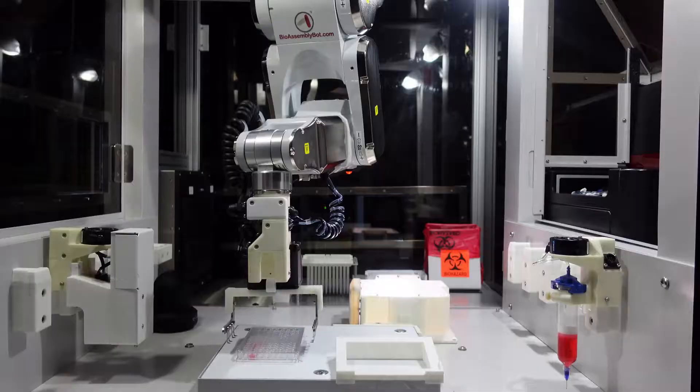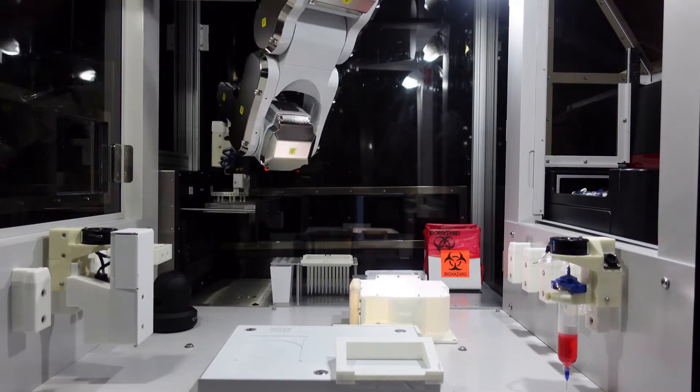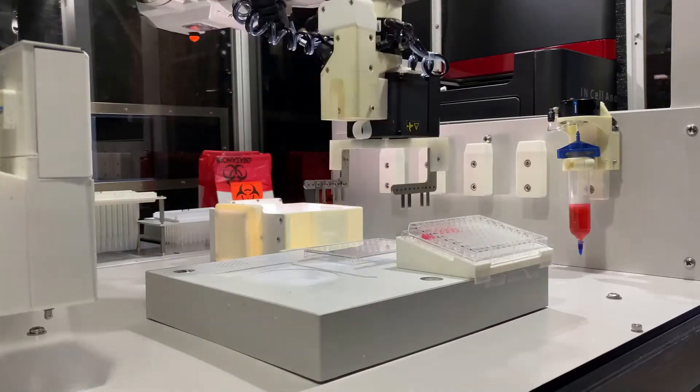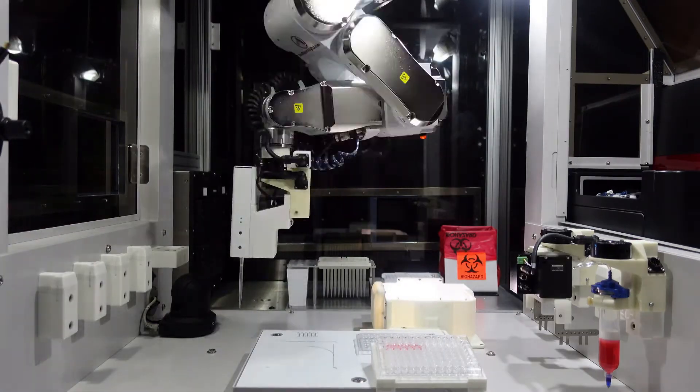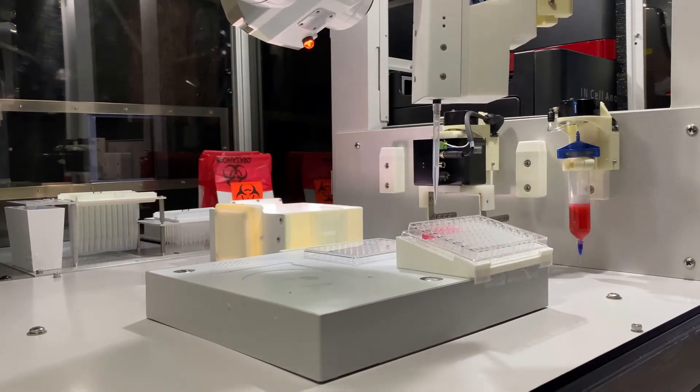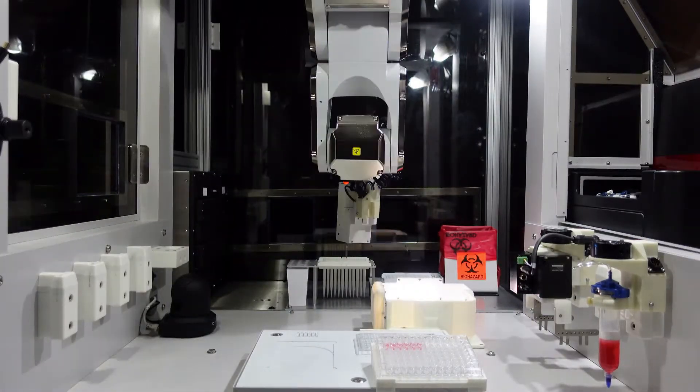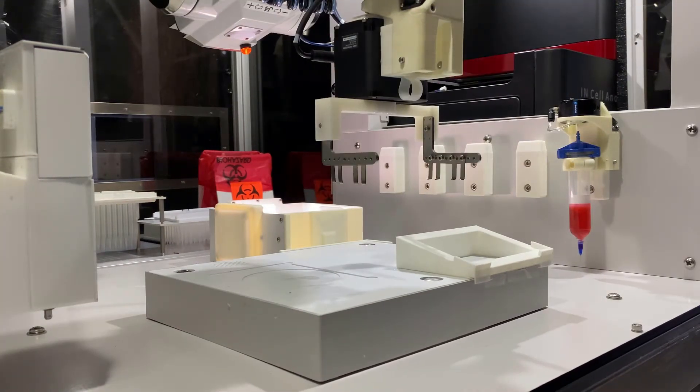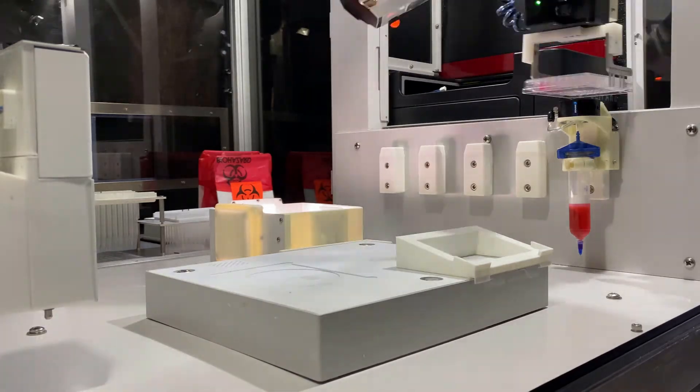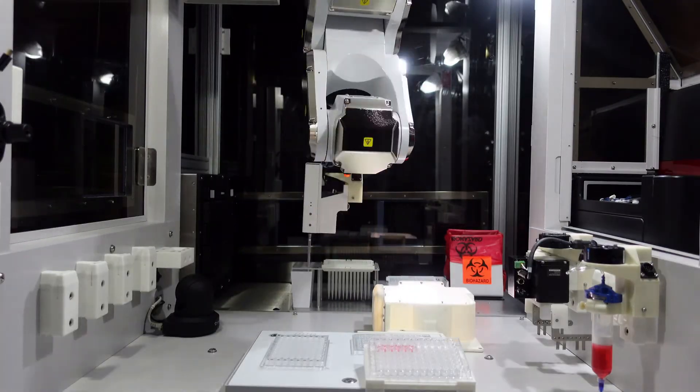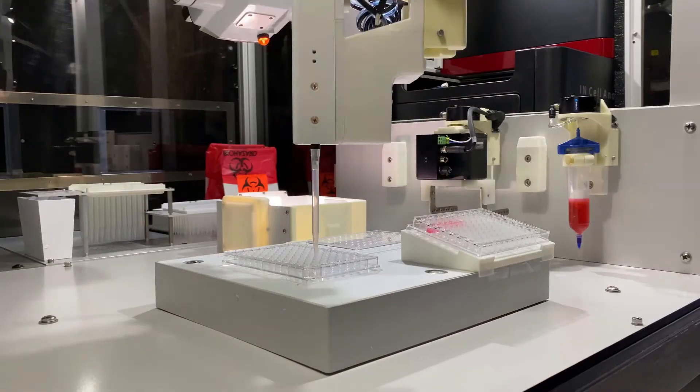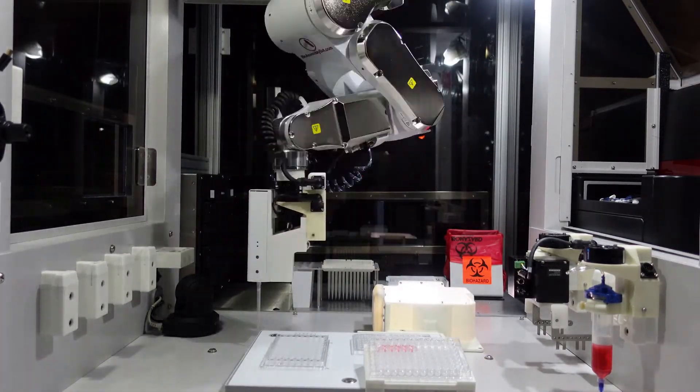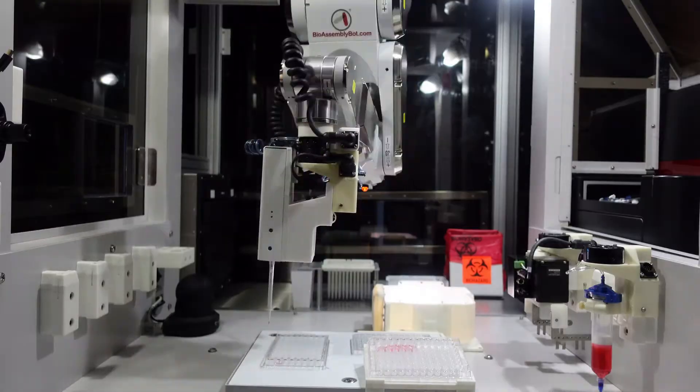BioStorageBot incubation and tissue perfusion equipment and even confocal microscope imaging are just a few ways BAB's robotic value can be extended. The BAB platform can build and feed the biology, incubate and perfuse the biology, and image and analyze the biology over prescribed time intervals. A complete and precise workflow ensuring the 3D biology is assembled in a way that repeatedly delivers desired tissue outcomes.